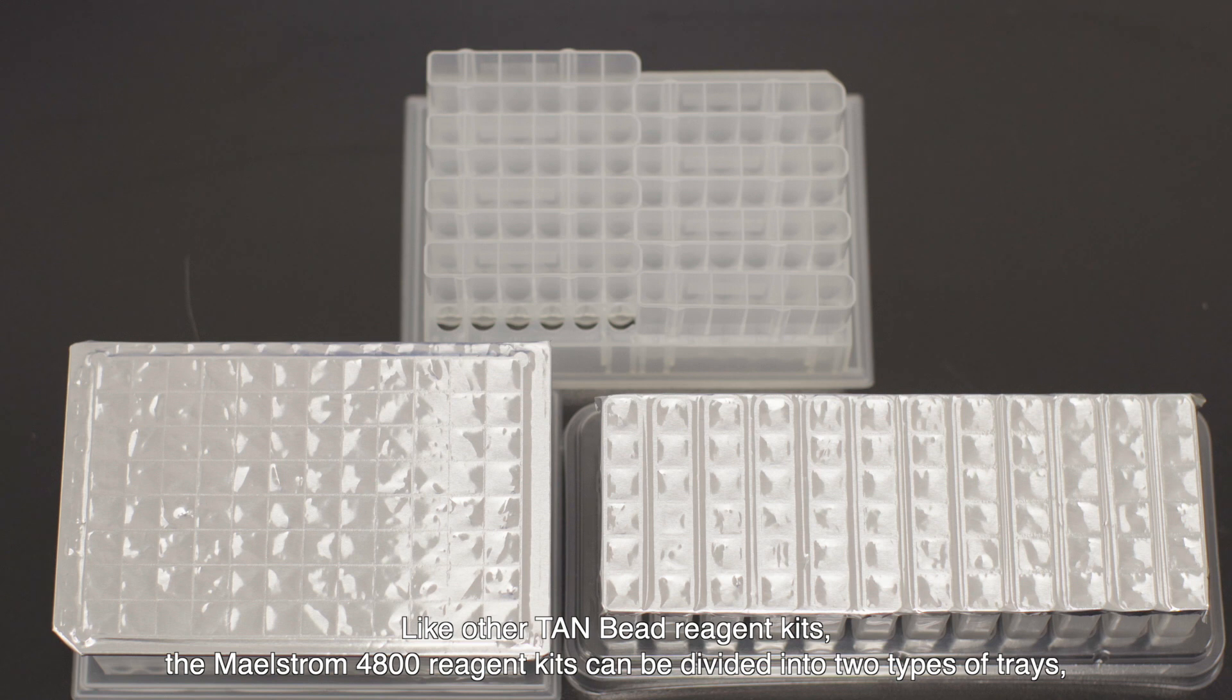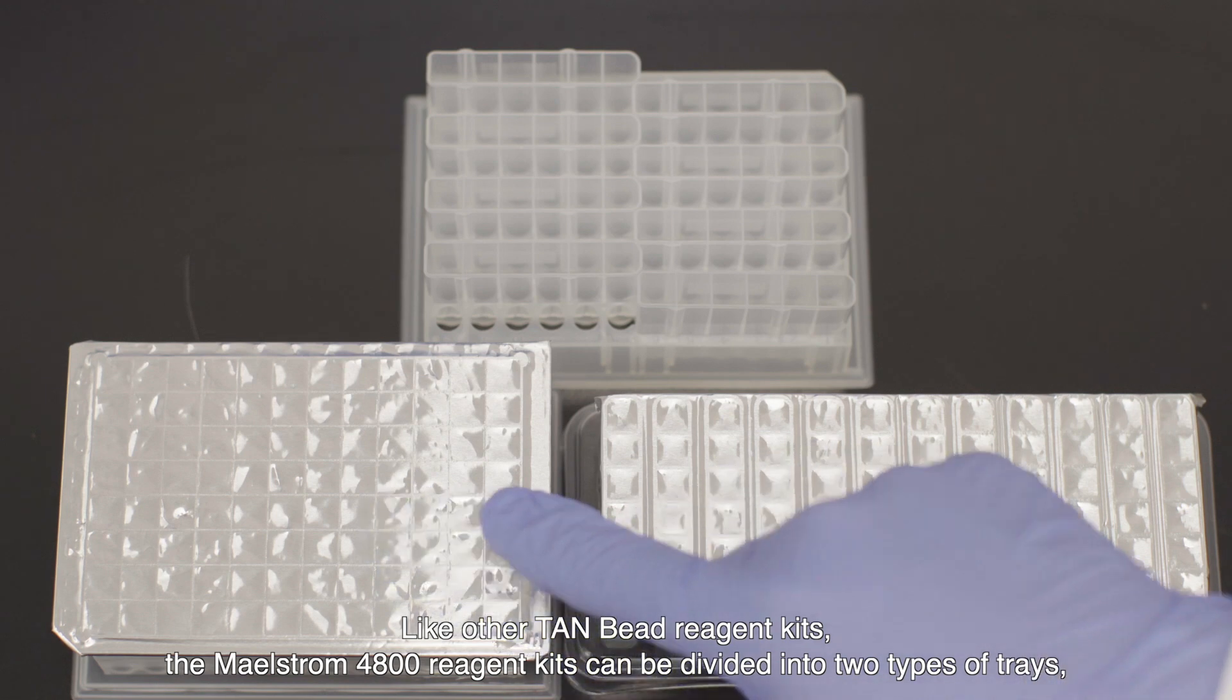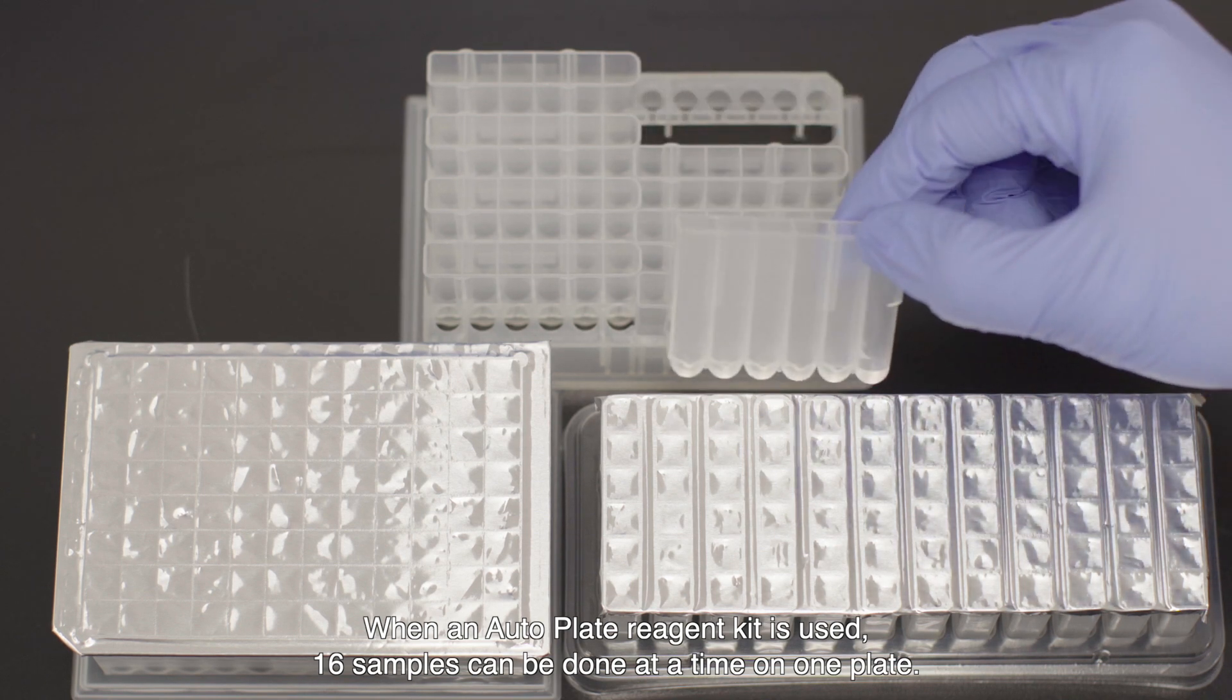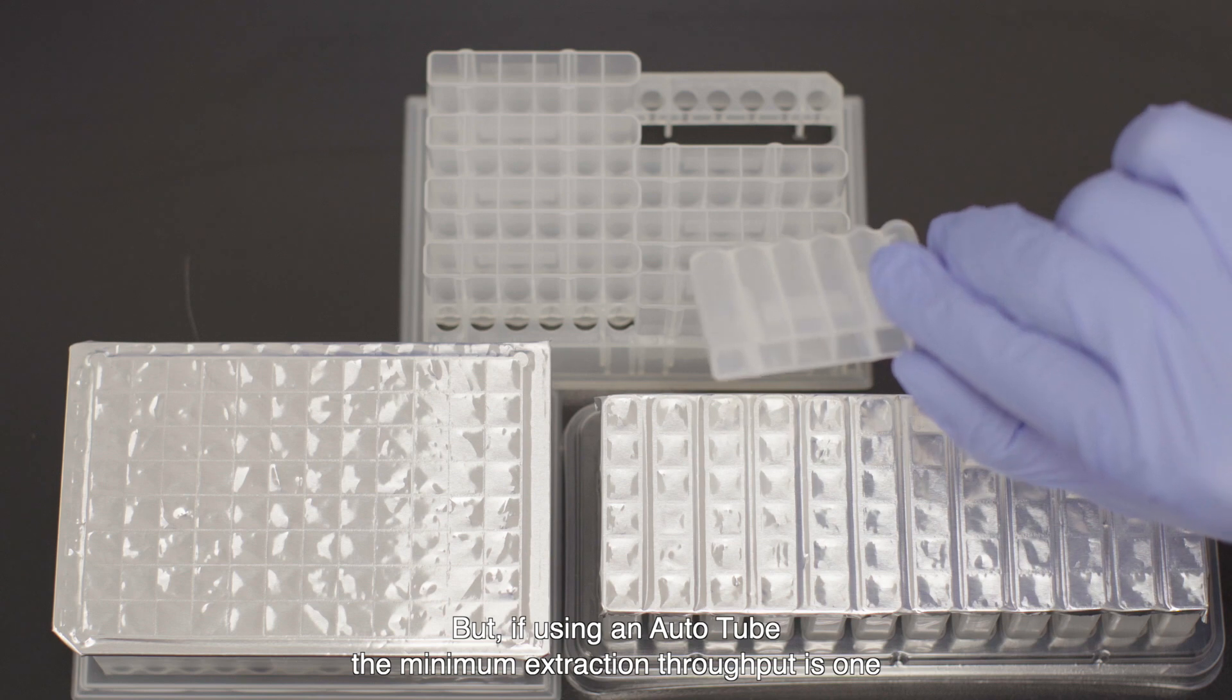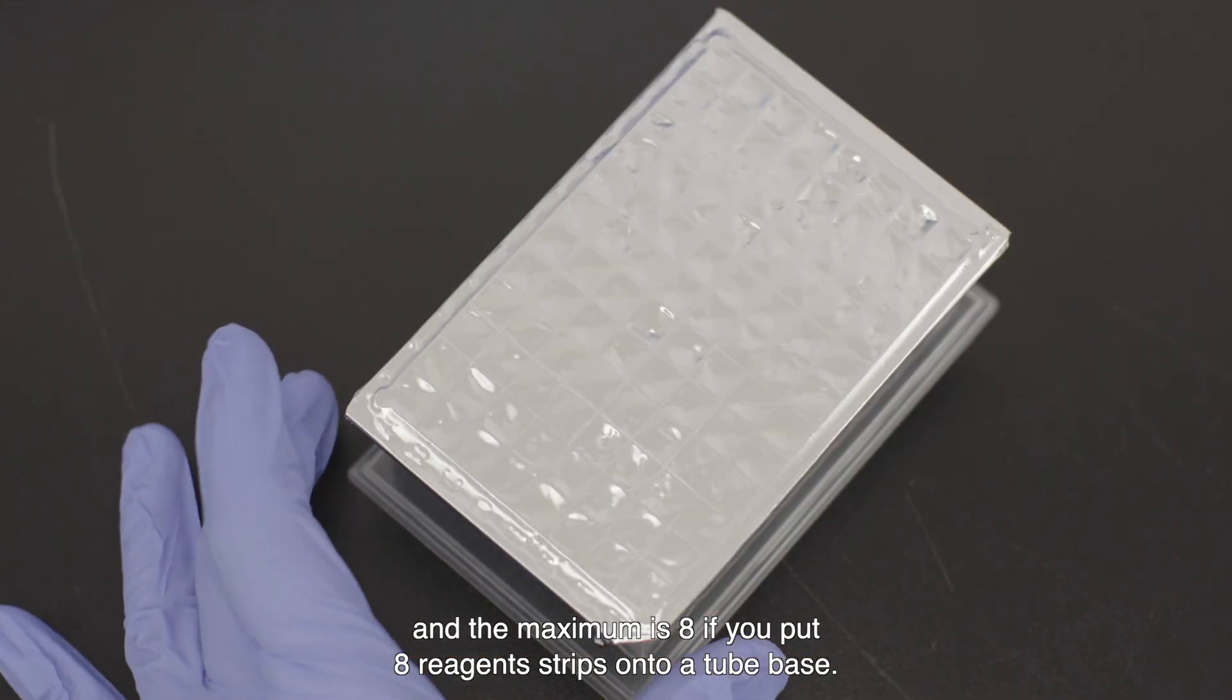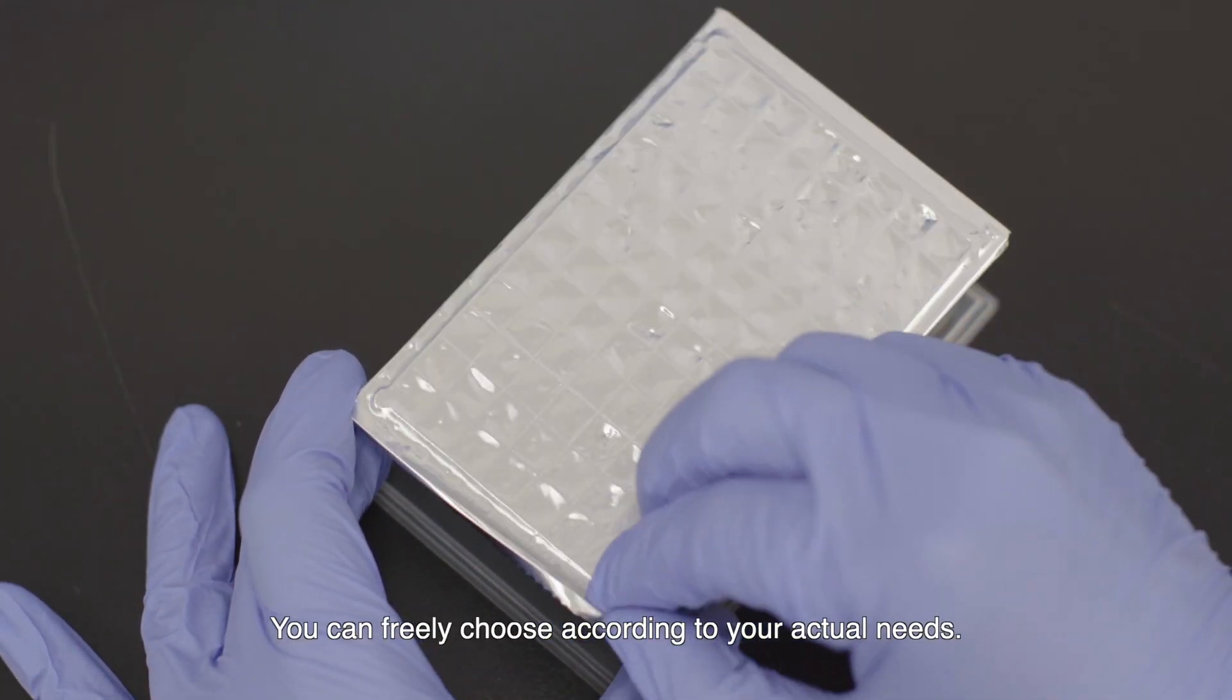Like other TAM bead reagent kits, the Maelstrom 4800 reagent kits can be divided into two types of trays: the auto plate and auto tube. When an auto plate reagent kit is used, 16 samples can be done at a time on one plate, but if using an auto tube, the minimum extraction throughput is one and the maximum is eight if you put eight reagent strips onto the tube base. You can freely choose according to your actual needs.